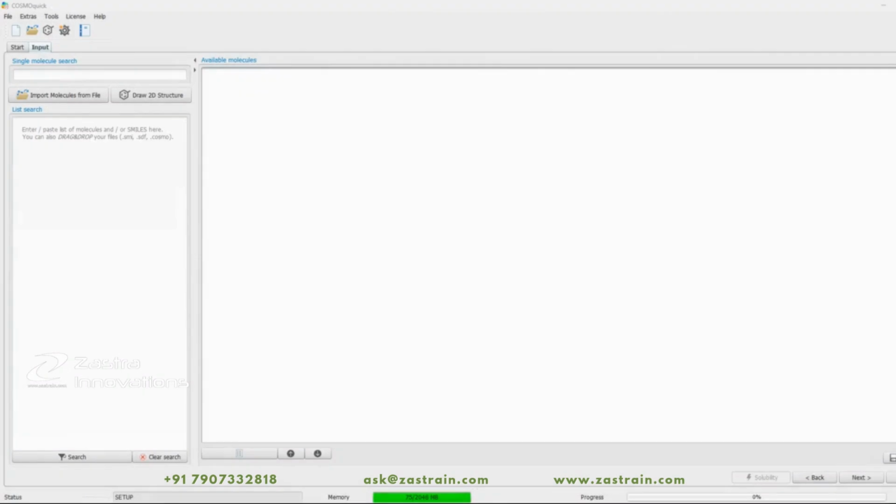So, hi everyone. In the last few videos, we have covered a few modules of the COSMO suite, such as COSMOtherm. We have also covered the basics of TURBOMOLE, doing basic calculations such as electron affinity calculation or geometry optimization, and a few others. So in this particular video, we are going to see COSMOquick. COSMOquick is also one of the other modules of the COSMO suite.